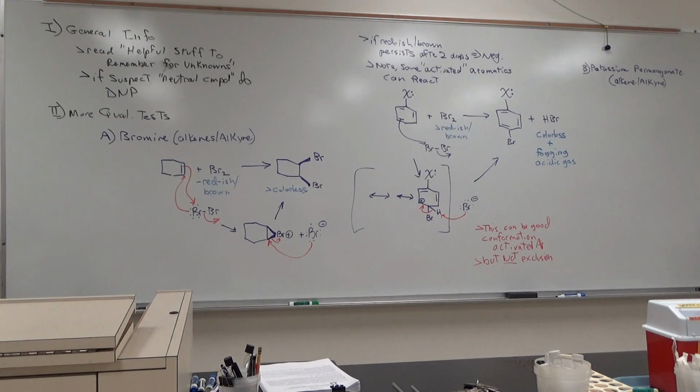Okay? So we have two tests for it. They're both very easy tests to run, so it's worth having them in there. If they were both very involved reactions to run, maybe we'd think about excluding one of them because it is a little bit redundant. This is also known, by the way, as the Baeyer test.